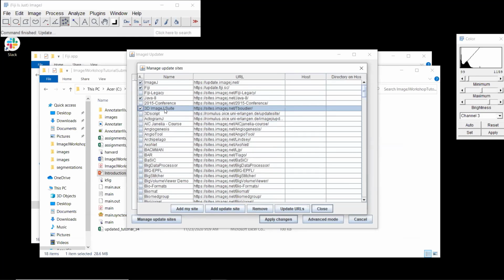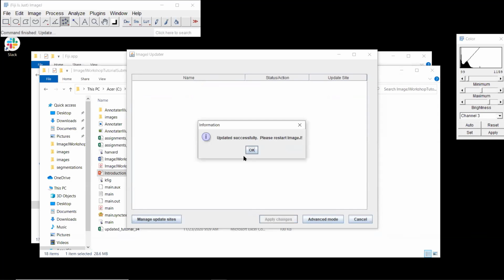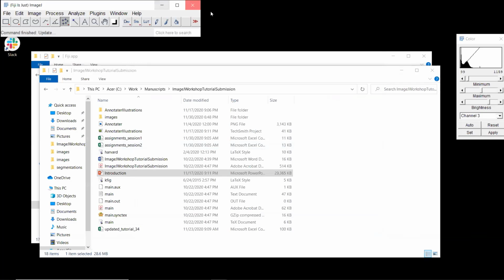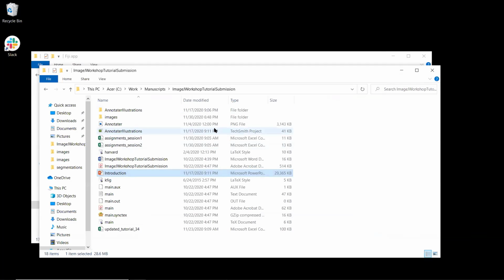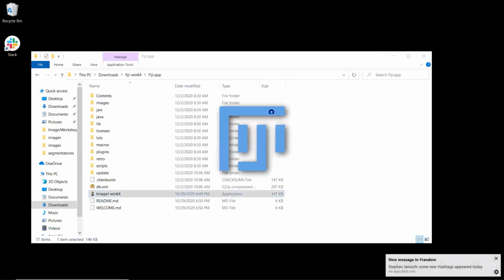But when you have lots of labels, which is what we have here, we have nuclei, we want to do this kind of operation for each individual nucleus, and they already have something really powerful. So that's why we use that. So you add it, you close it, and now it's going to install the required plugins. So I just apply changes, and I'm going to have to restart ImageJ. If you have any trouble with that, just tell me. Let's close that. So I'm going to restart ImageJ.